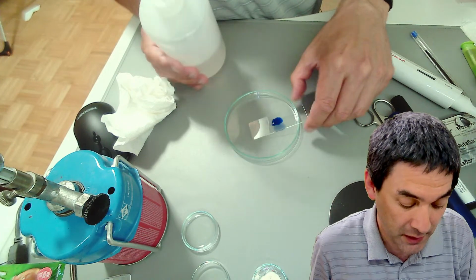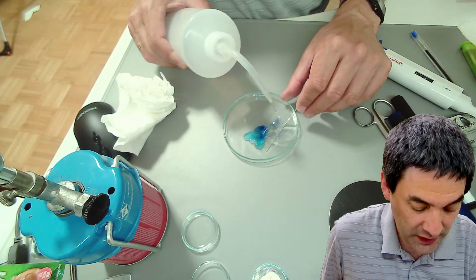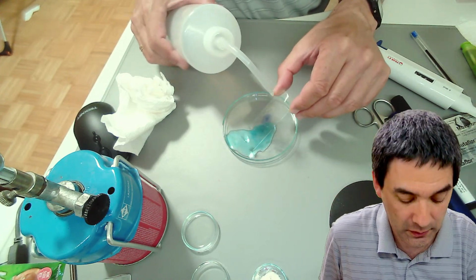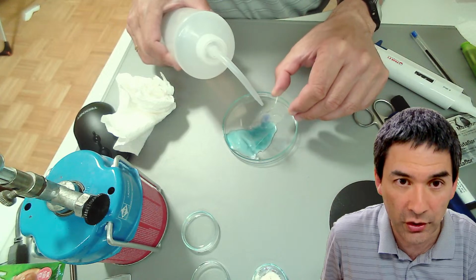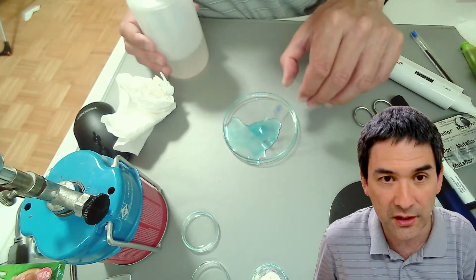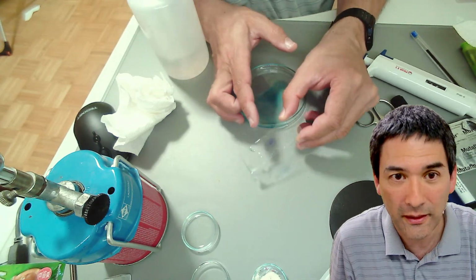That is simply by holding it like this and using some water and rinsing it off. You don't want to go with the water directly on the bacteria, but over it, and then you're kind of rinsing away, and you can already see that where the bacteria were, it's more blue.